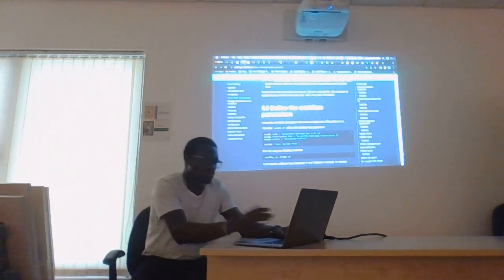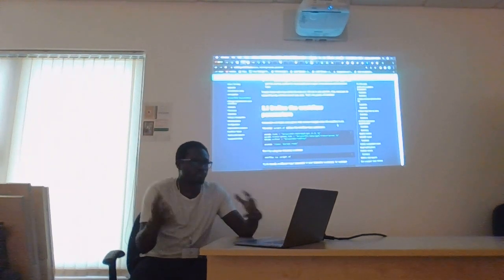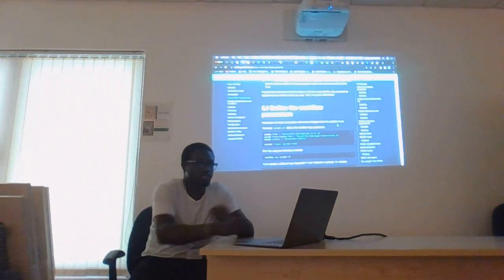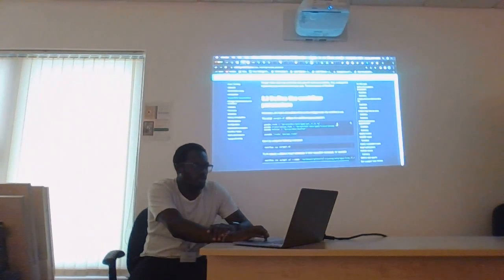So we'll just review what they have put here and try to put our heads together in order to understand the steps, whatever is happening in each of these scripts. So the first script had these lines.